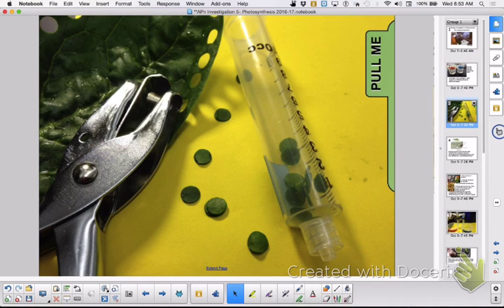And that's where this little tool from Starbucks comes into play that I've got in here. This is the disc remover, okay? And so it works great. And if you have some that aren't sinking, or this one has 10 sinking discs and this one has 8, remove the extra sinking disc with this, okay?